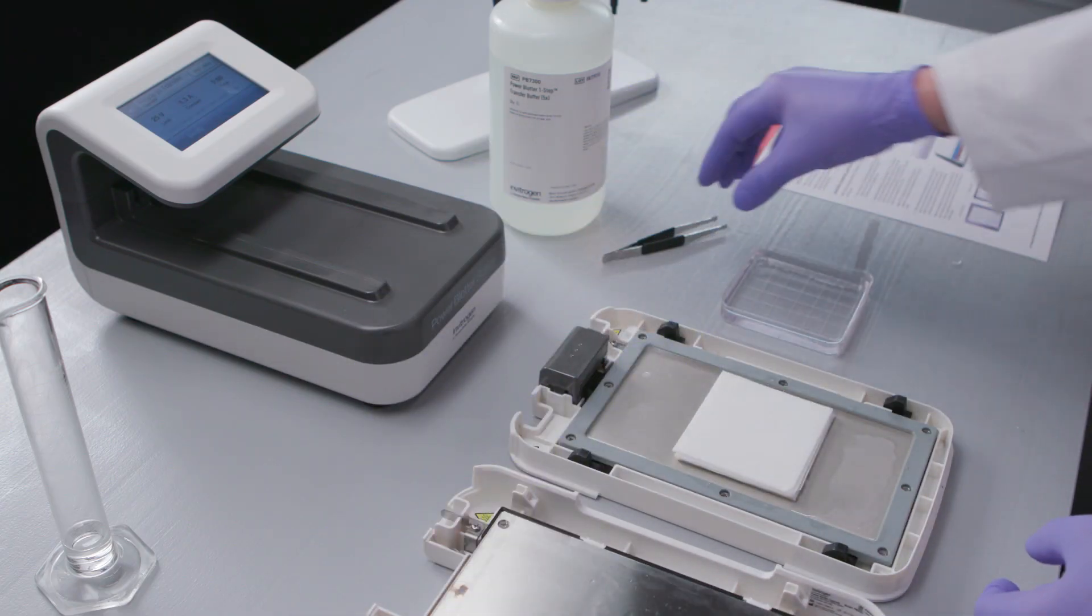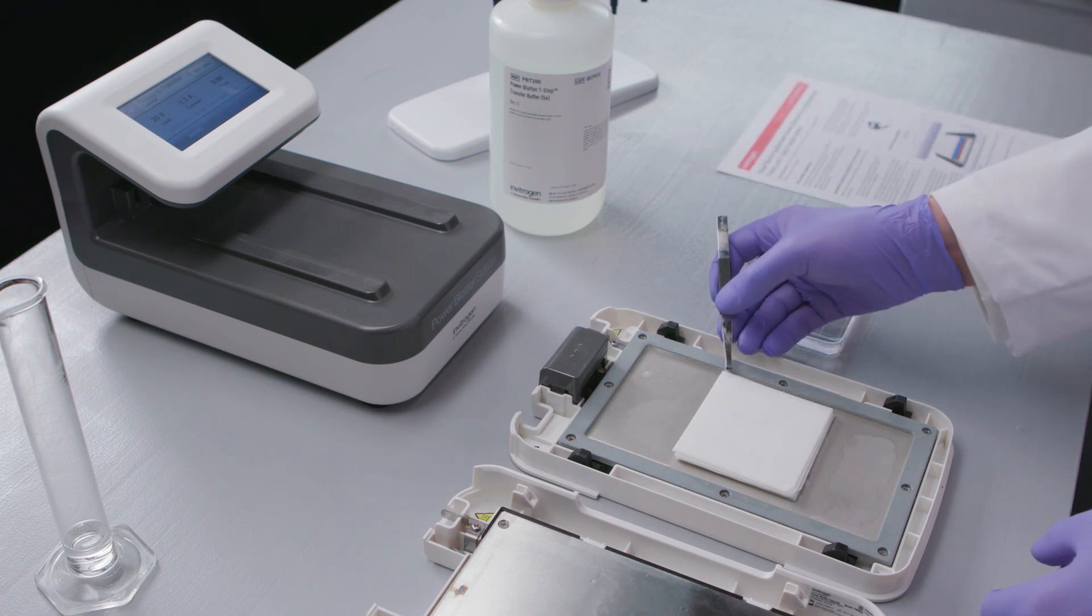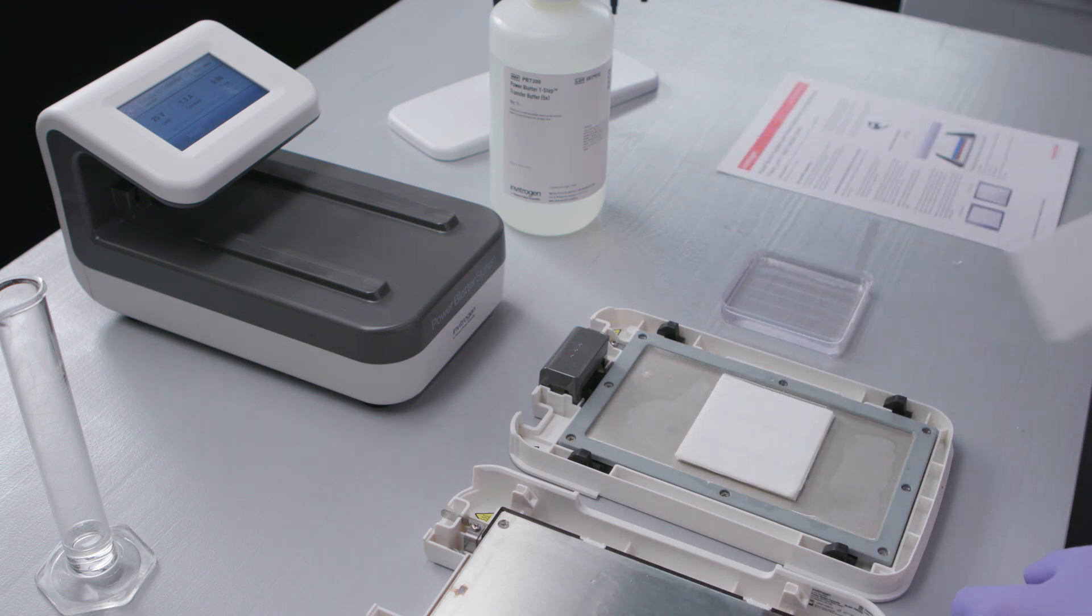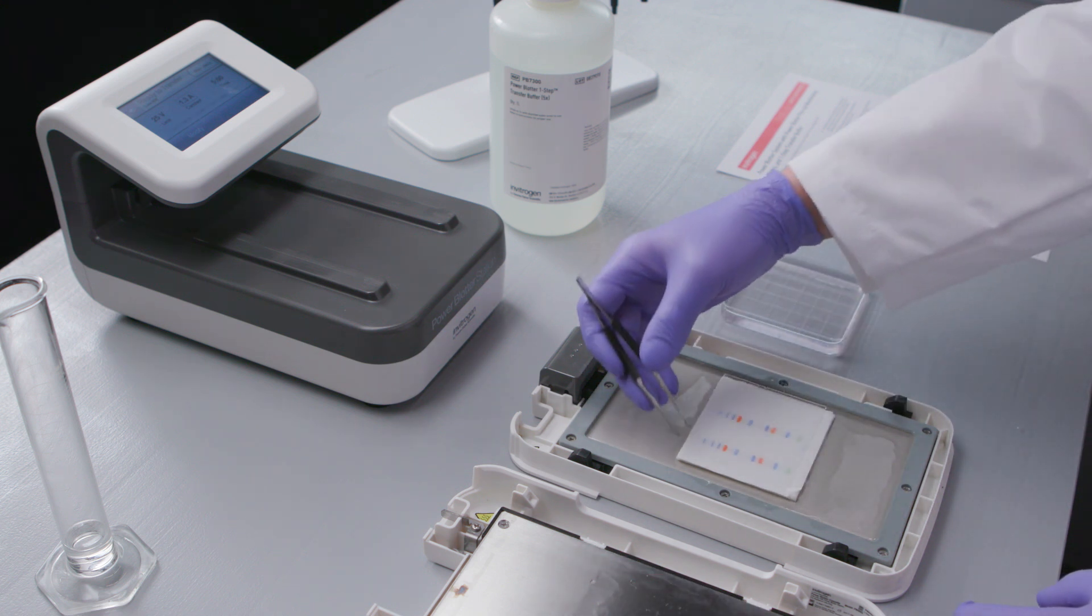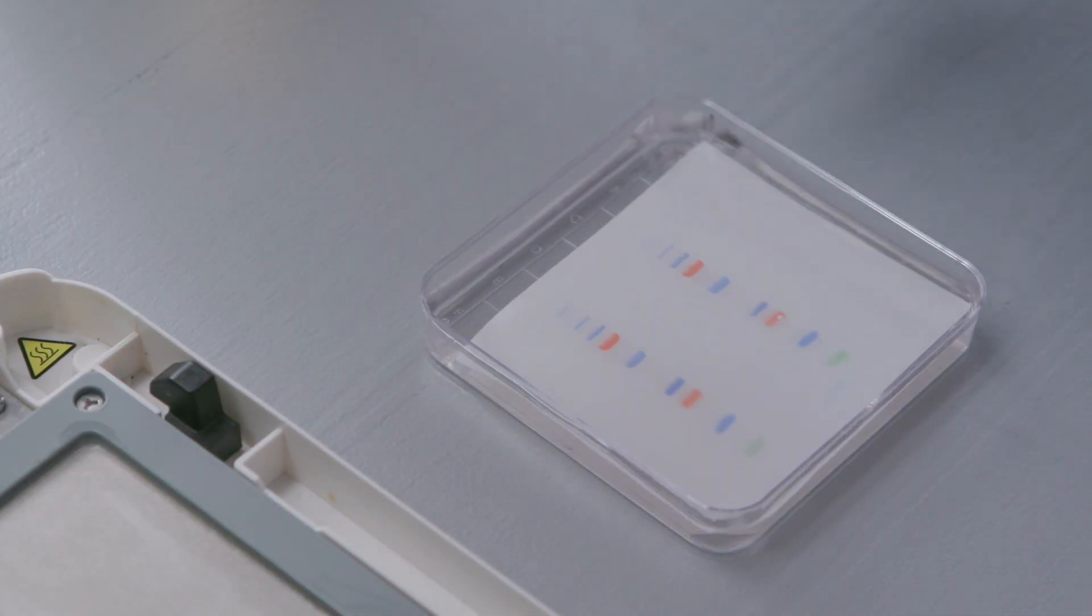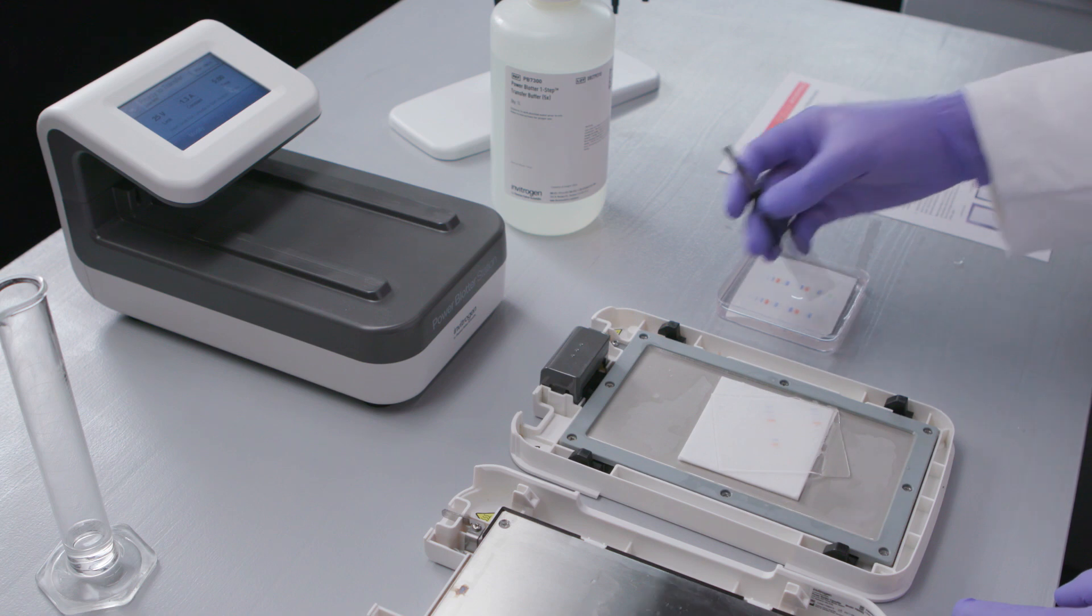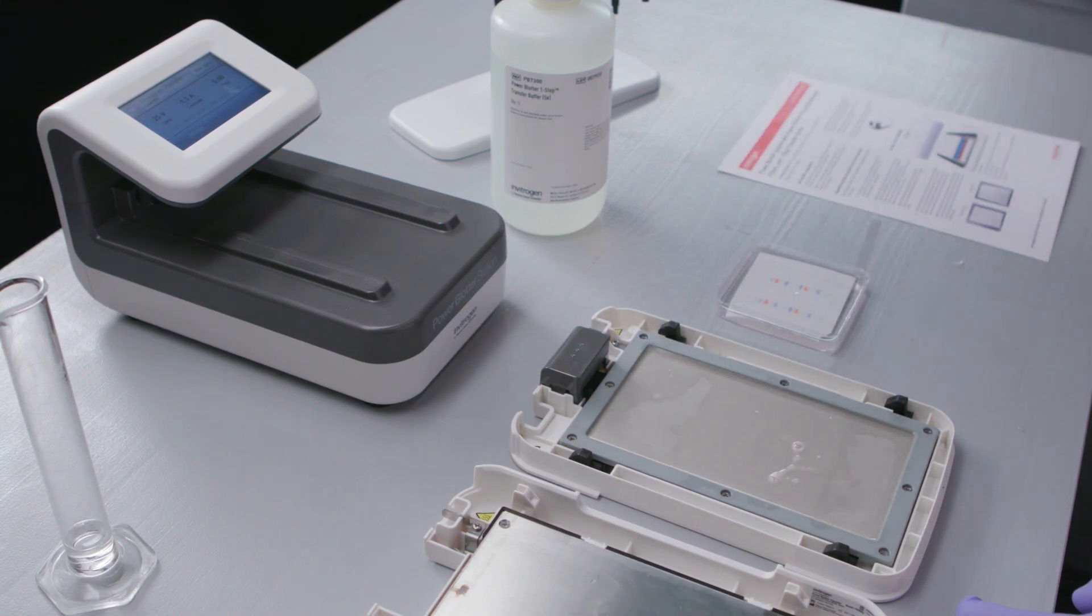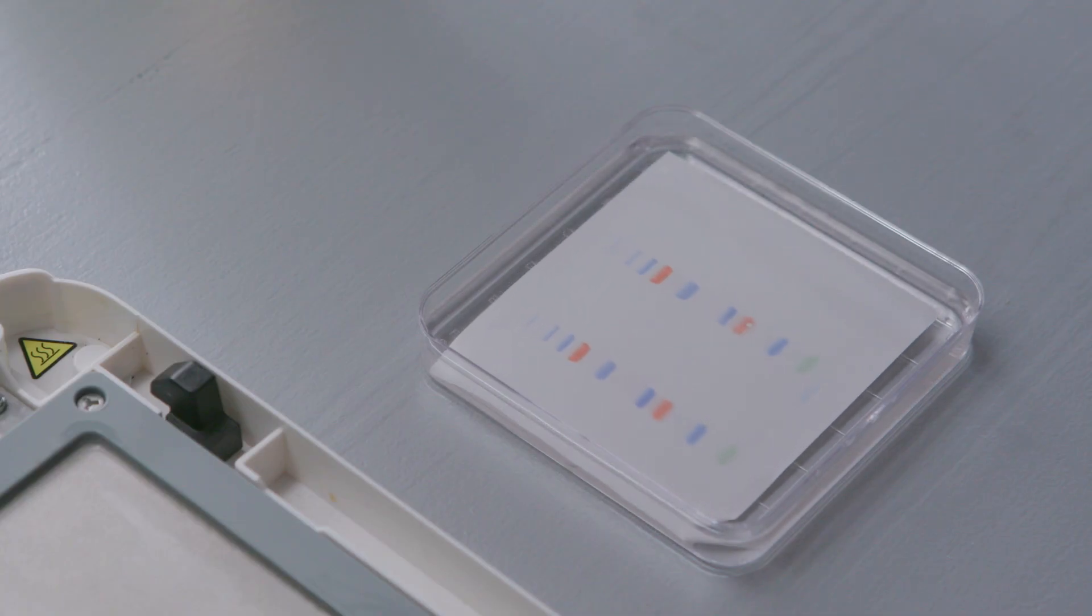Carefully remove and discard the top two filter papers and the gel. Use forceps to remove the transfer membrane. Discard the two bottom filter papers. Now your membrane is ready to be blocked and probed for your specific proteins.